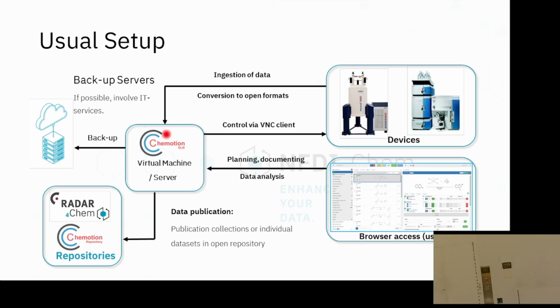The ELN itself is backed up. We need to set that up when we are installing the ELN. And at the end of everything, when you have done your experiment, the ELN helps you in a lot of manners. I'm not a clever chemist, so I'm not going into those details. But basically, you can do the entire experiment within the ELN in terms of thinking through and getting to your result, including the analysis. And at the end of it, we keep up with the spirit and move the data to a repository so that not just your results are available through a paper, but also your data is available at a repository where people can access it using DOIs.